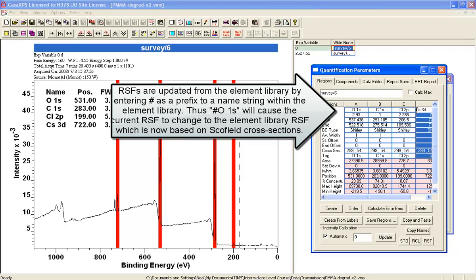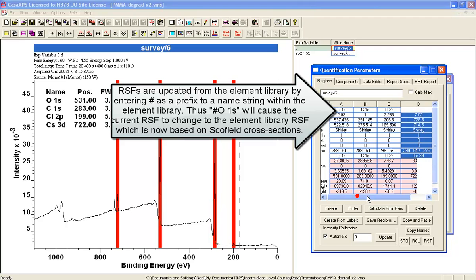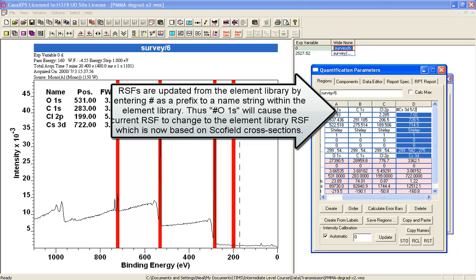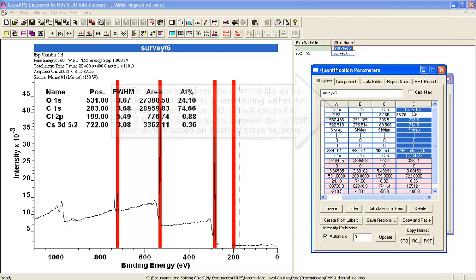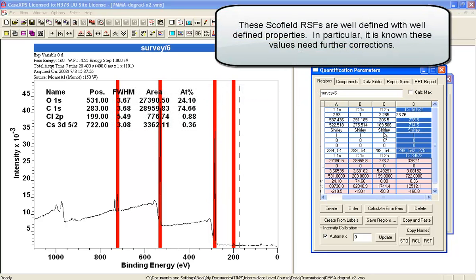In this case, I'm going to have to use the five halves. That gives me a corresponding set of RSFs that are now based on transition probabilities.